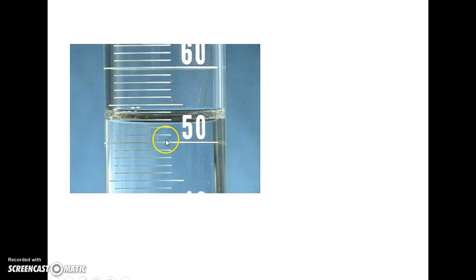Most of the time, there will be either 10 spaces, 5, or 2. Those are the main 3 possibilities. 10, 5, or 2. Nothing in between. No 3, no 4, no 7. It's really just 10, 5, or 2.